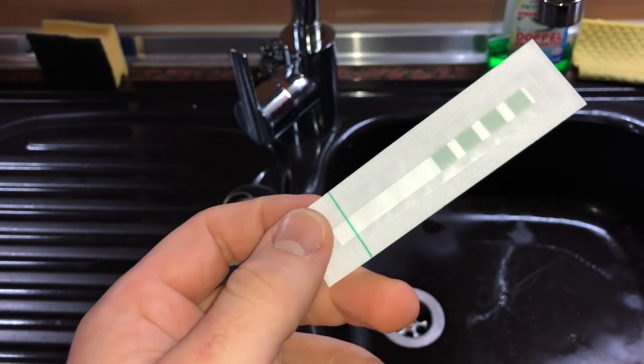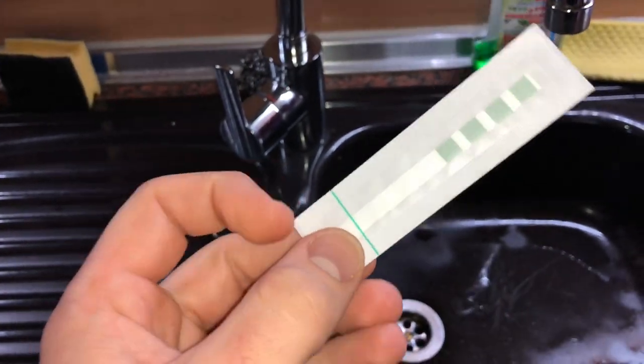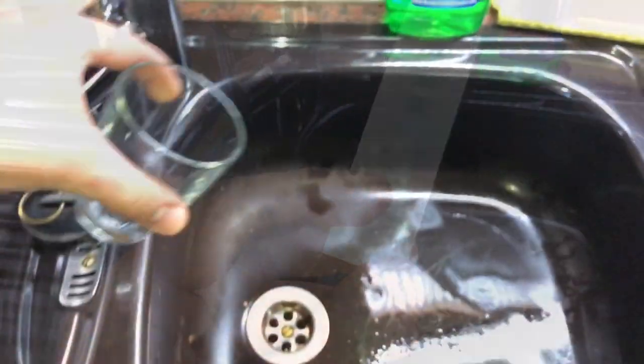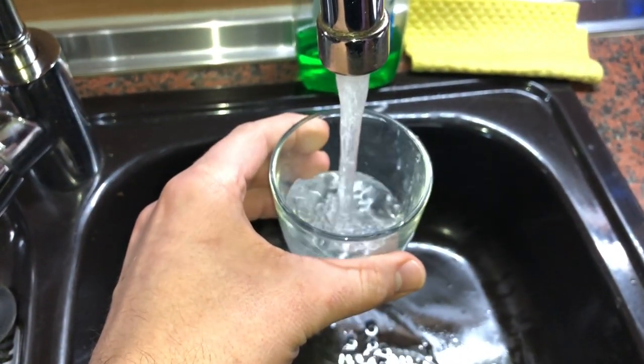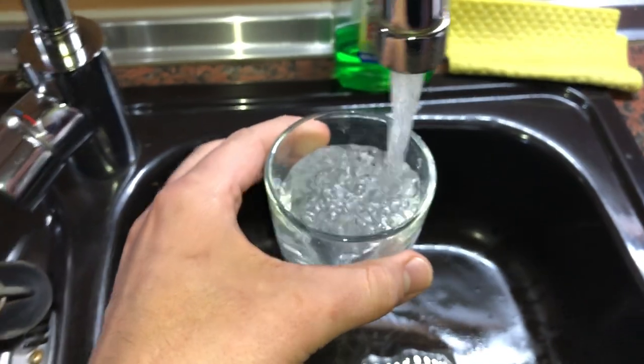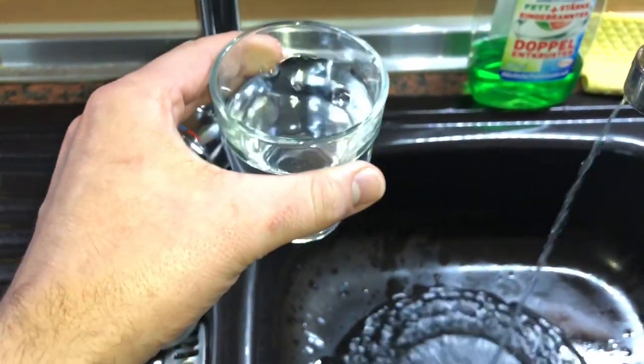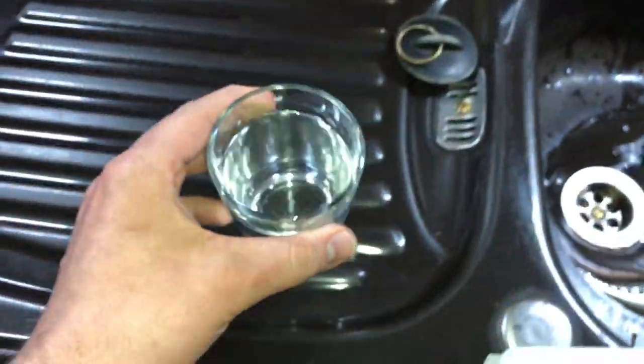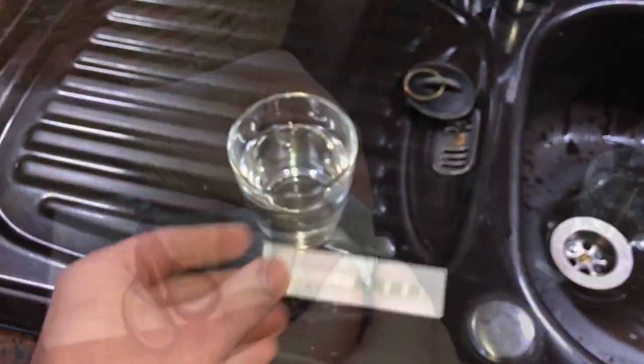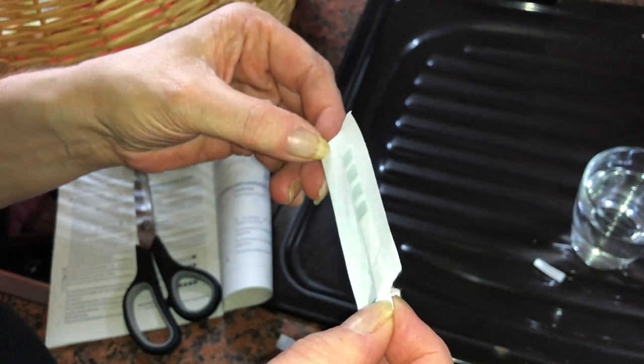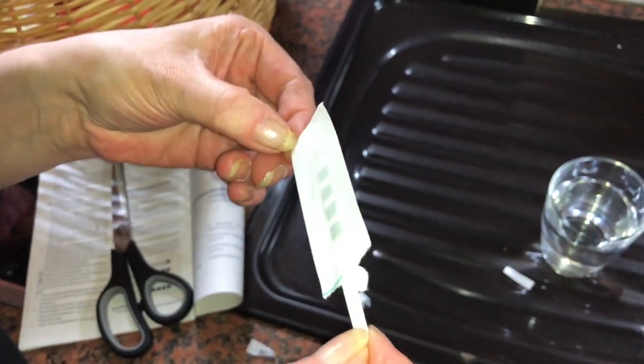And this we have first to open. Now make a glass full of fresh water which you are going to test. Now it's time to test.